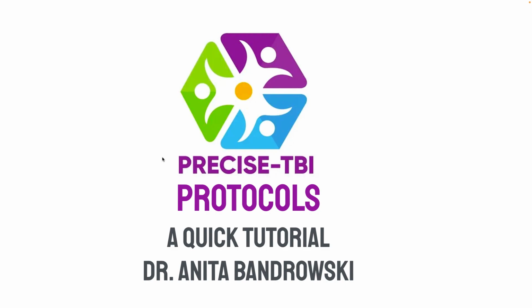This is going to be a very quick tutorial about how to make your protocol a little bit better. I want to take you through some fun features. My name is Dr. Anita Bandrowski, and I'm one of the team at PRECISE-TBI.